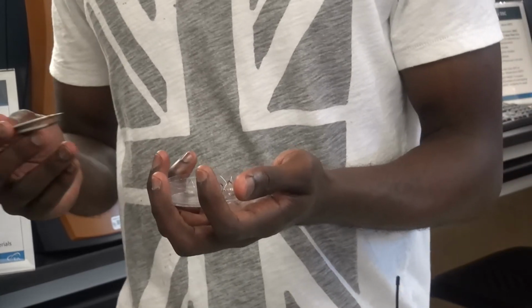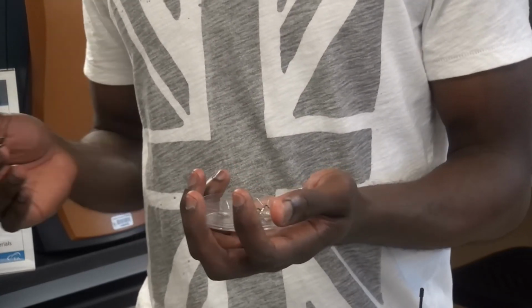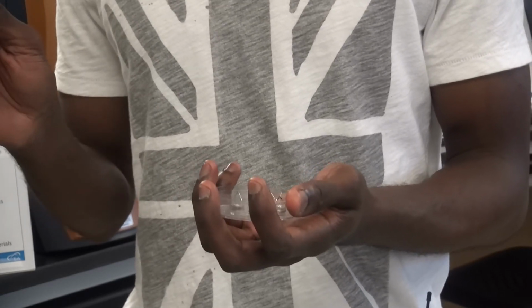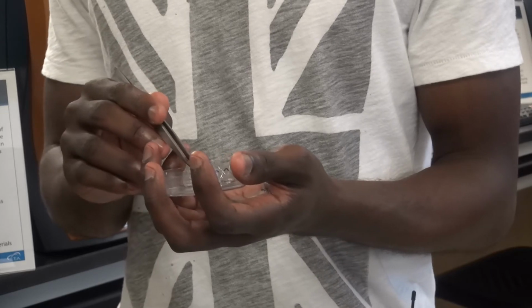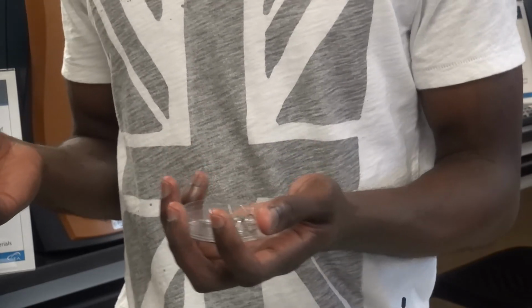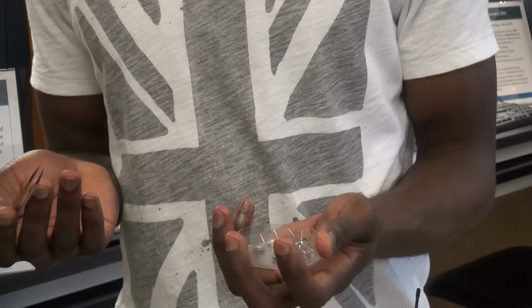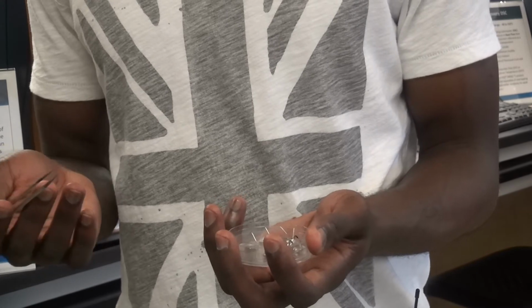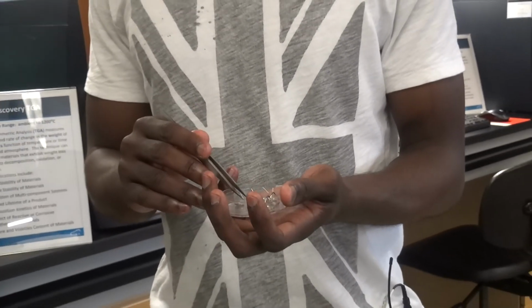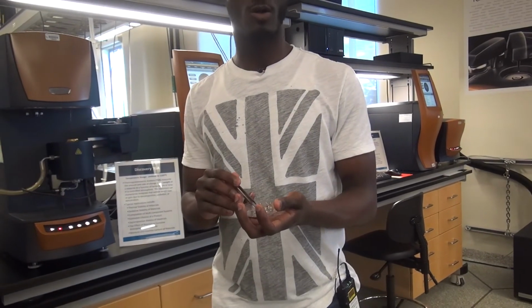Not necessarily. It doesn't make anything more accurate, right? Your accuracy isn't the problem. The problem is just that one little point of it sticking to the hook. So if you want to only buy these, I mean, that's okay. But considering most people don't really want to go above 700 anyway, especially if you're doing polymer materials and things like that, then there's really no big deal in just buying the standard ones instead of paying extra for these, right? Because these do cost a little bit more.